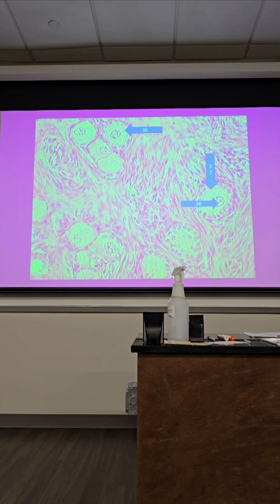Okay? Where can we see that one? Is that not one shown on this one? The tertiary follicle. On the lab list it says vesicular follicle, or it should say mature Graafian follicle. It says tertiary follicle too? Yes. All those names are the same thing. Tertiary, right? So the only one with the secondary oocyte is the tertiary follicle. Why do they have so many names for one thing? Choose one. But you can't see those.